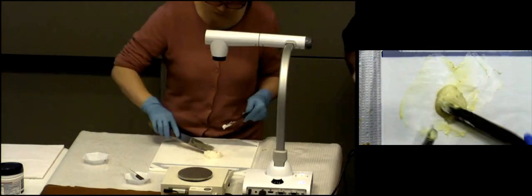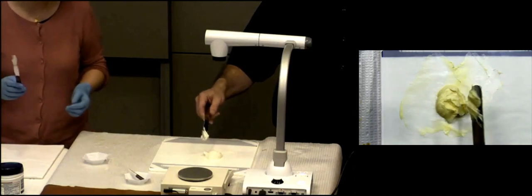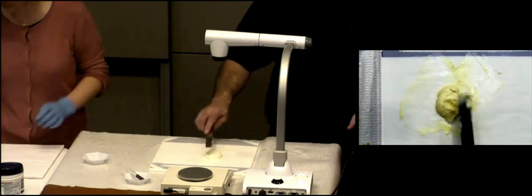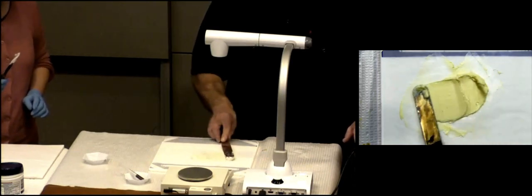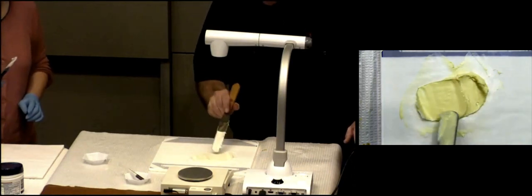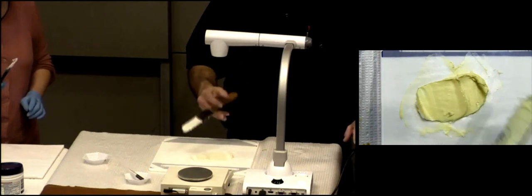So, yep. As you're doing this, what was the point of the levigation? We wanted to avoid what? Chunks. Would you agree? So as you're doing this, when you think, okay, am I doing pretty good? You want to slather to make it kind of a thin base there. And uh-oh, there is a spot right there. Can you see that little spot right there? So do you know what you need to do?